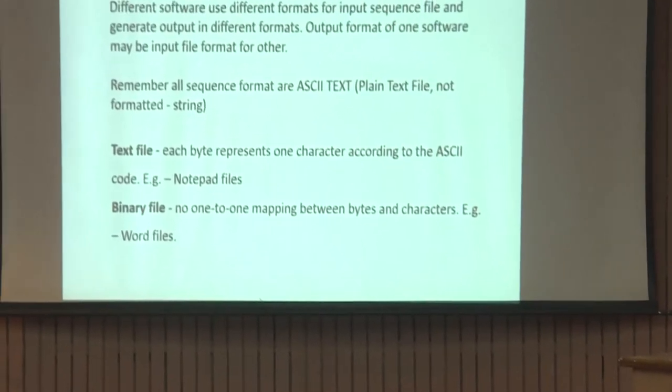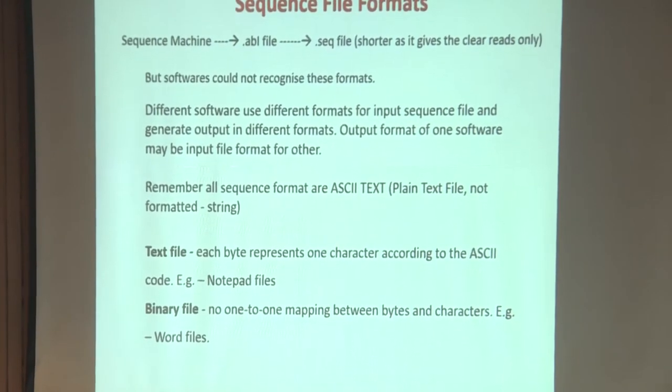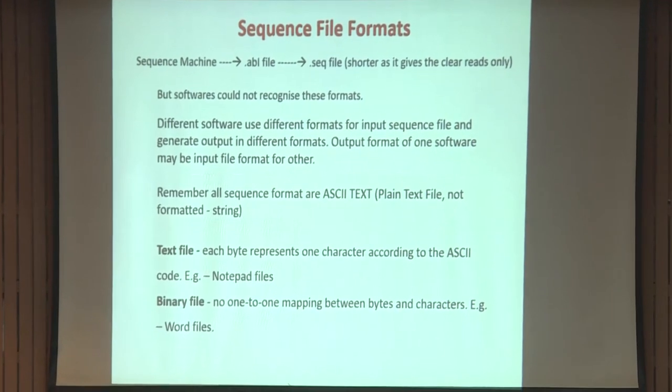So the Word file is actually a binary file. But all the sequences, as I told you, are string files, they are continuous, one character means one byte. So we should not process any sequence file using a word processor. Always we have to use notepad to create any file format. If you try to create your sequence file using a binary file or word processor, then those formats will not be recognized by the software which you will be using. So always remember, create the file using notepad and using the ASCII text format. How, I will show you.